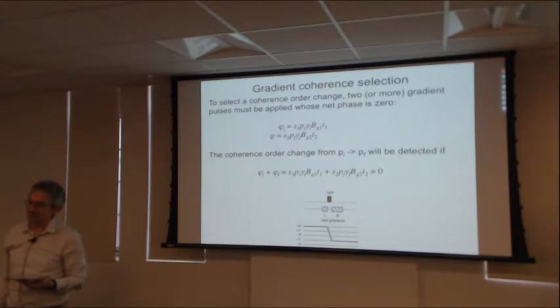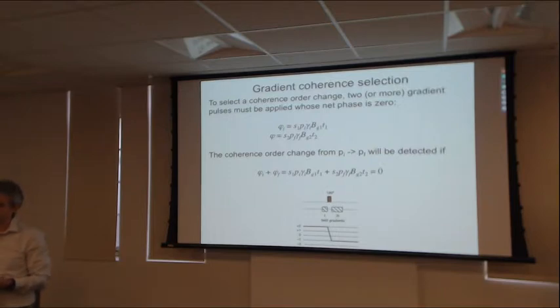It's much less of a problem now. People are still in the habit lots of times of having to shape and round the edges a little bit. But it doesn't matter to the math, because it's just the integrated area that's important. And usually, when applying pairs of gradients, if they're shaped, you'll use the same shape for each member of the pair, and then you don't have to worry about matching the intervals in the shapes.